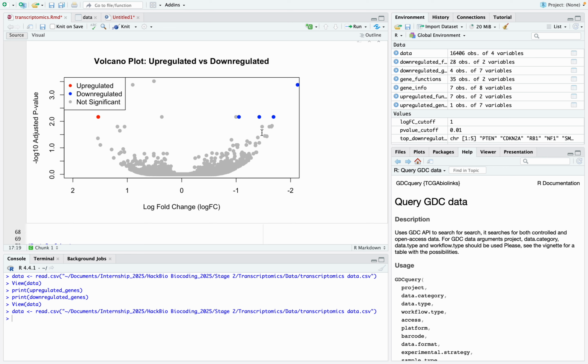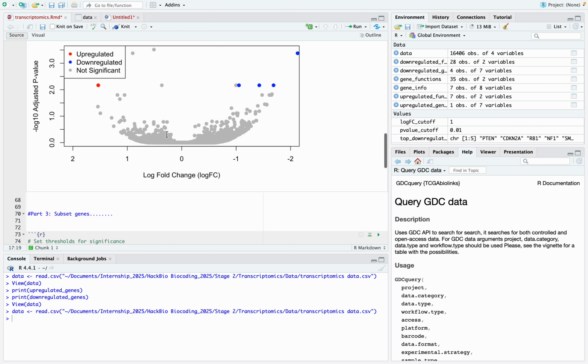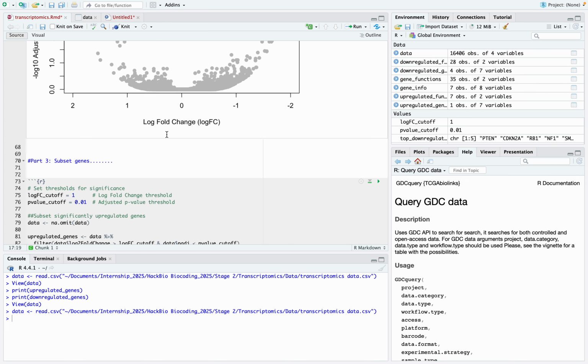There are a couple of important points about this Volcano plot. When we have large RNA-seq data, this kind of plot makes it easier to visualize which genes are significantly increased in expression and which are significantly decreased. So it's really easy to visualize from big data. Normally the genes which are highly expressed based on their cutoff value show up easily in this plot.